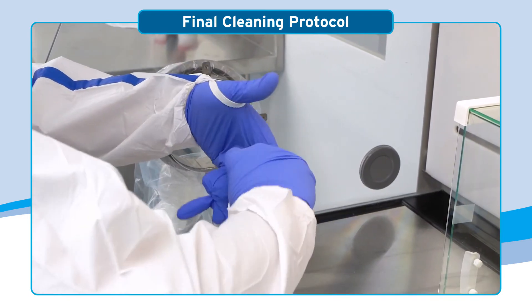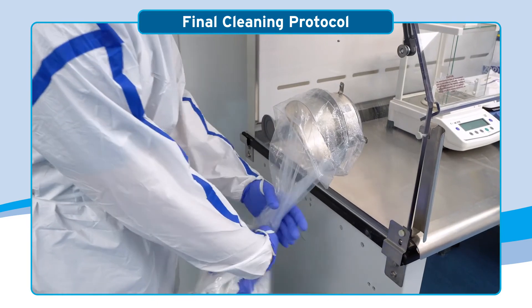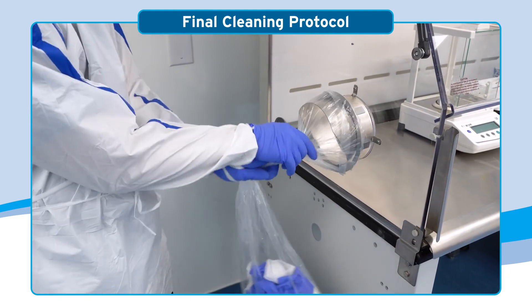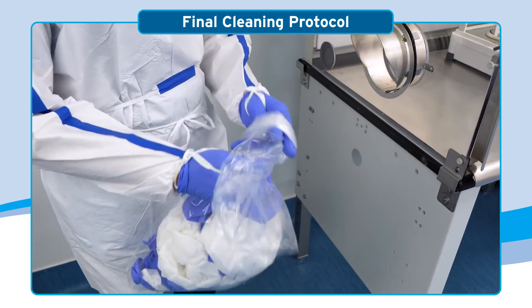At the end of a shift, or when the waste bag is mostly full, the best practice for removing the bag is to twist and hold the neck while slowly sliding it off the waste chute collar. Finally, tie a knot in the twisted bag so that no particulates can be released into the environment.